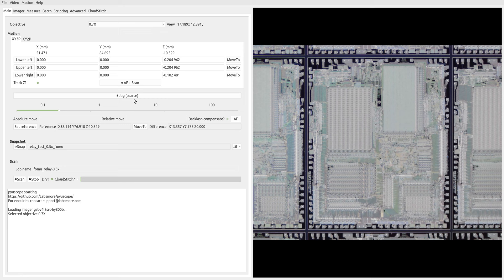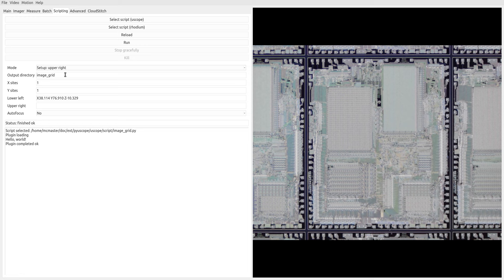and let's go back over to scripting. And now we are on the upper right-hand corner. So I'm going to say run, and now it's updated the upper right-hand corner into our parameter list here.